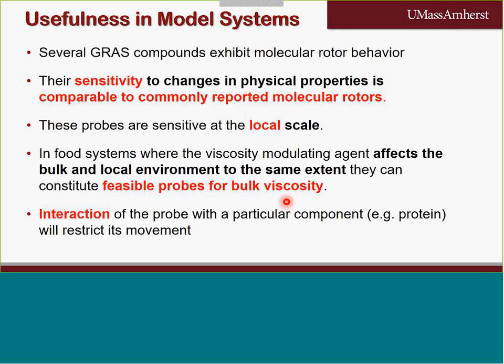In systems where the viscosity modulating agent affects the bulk and local environment to the same extent, they can therefore constitute an inline viscosity probe. The interaction of the probe with a particular component will restrict its movement and will make it a physical property probe for that interaction.